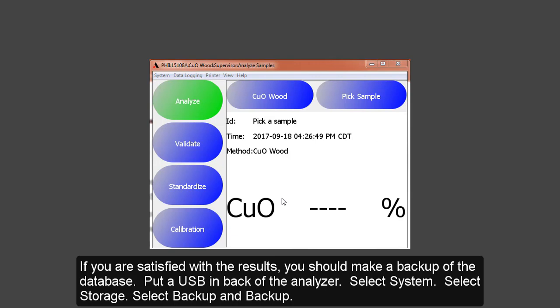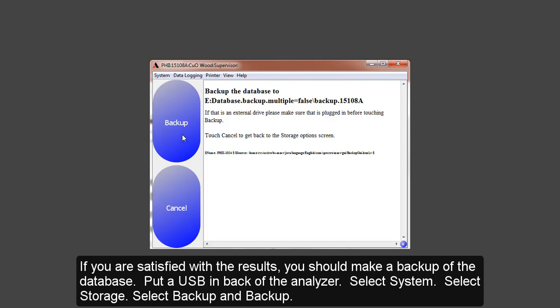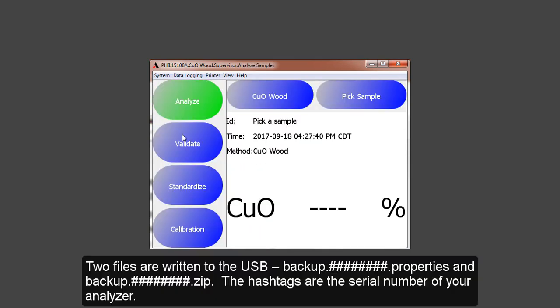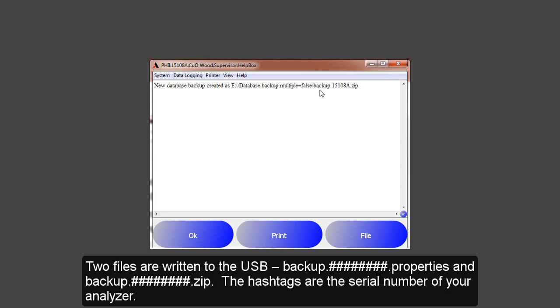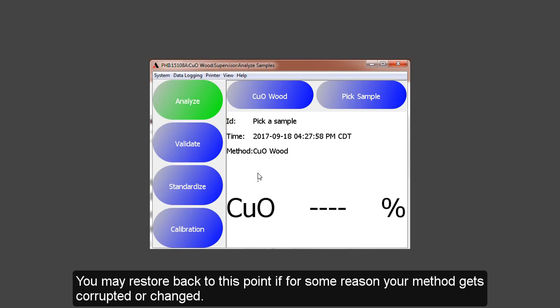If you are satisfied with the result, you should make a backup of the database. Put a USB drive in the back of the analyzer. Select System, then Storage, then Backup. Two files are put on the drive: one is backup dot your serial number dot zip, and the other is a backup dot the serial number dot properties. This will have all the instrument information as well as all your methods. The backup can be used to restore from this point if for some reason your method gets corrupted or changed.